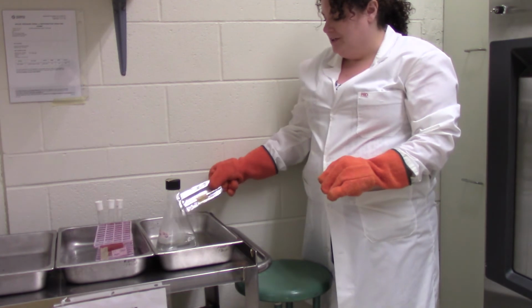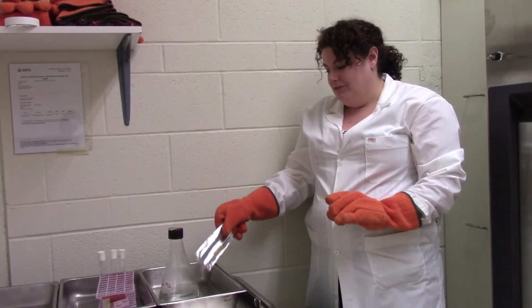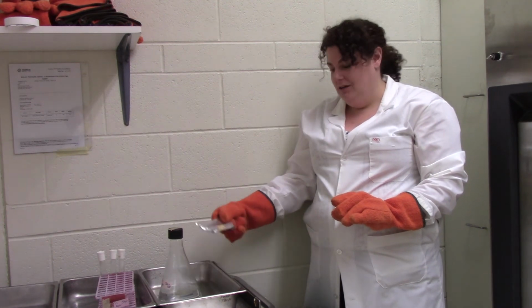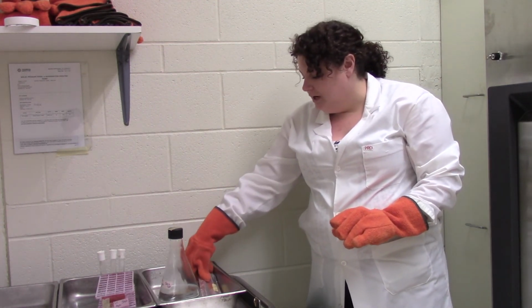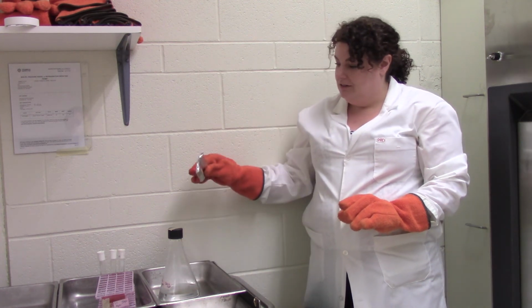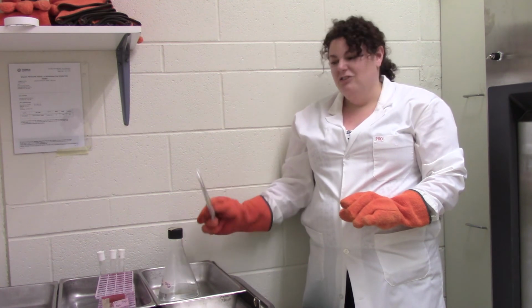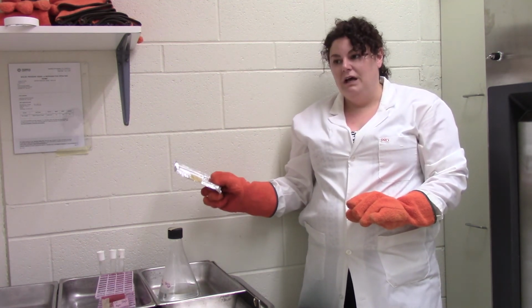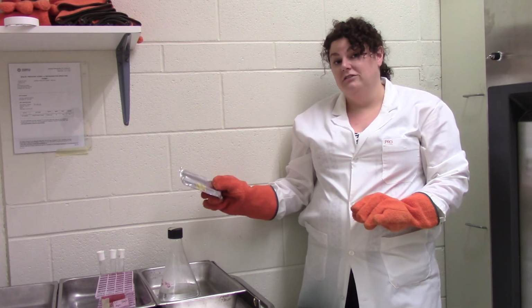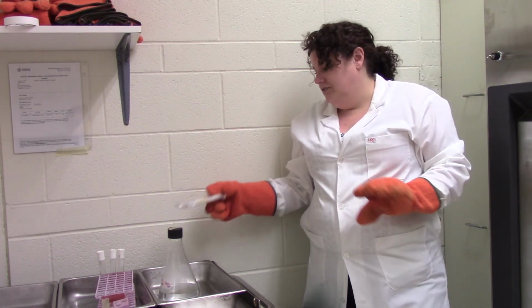So here's something that I actually did wrong. Wet items like liquid media and solid items like our spatula don't actually go together. So when I lifted this up, I've got lots of liquid in with it. It's not such a big deal when it's stainless steel spatulas, but if you had something that actually needed to stay very dry, you would use a dry cycle on the autoclave.